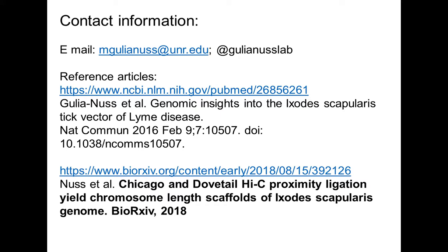Yeah, that's a good idea. That's a really good idea, Monika, to send generally more sample than we necessarily need. We can always send it back. What we don't want to do is, like Monika said, be in the middle of an extraction where for some reason it didn't work, and then we have to go back to you to get more tissue, and that will delay the project. So our project managers will give you the specific guidelines based on the kind of organism you're working with.